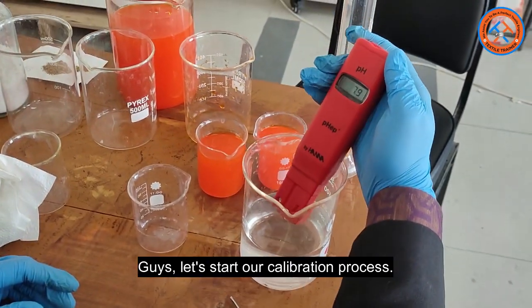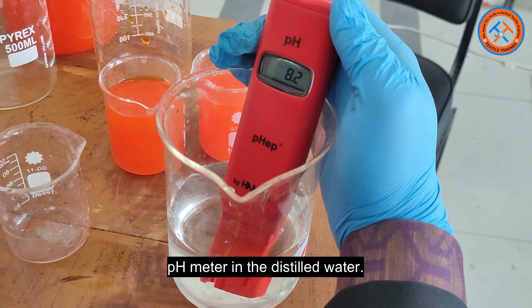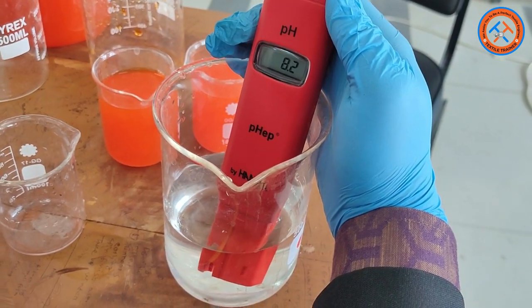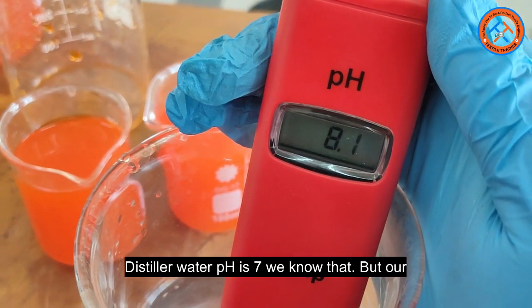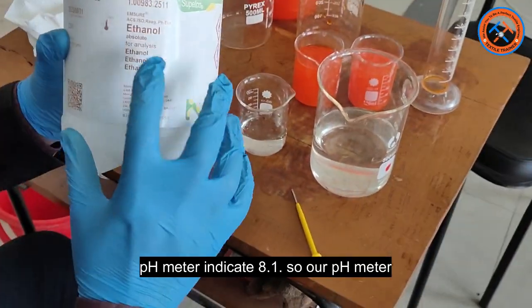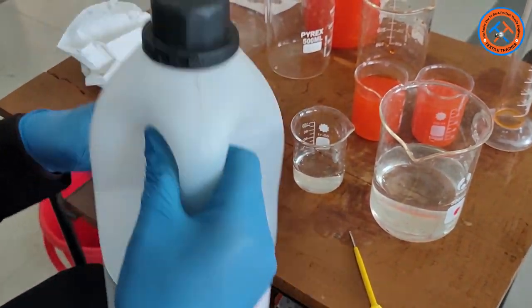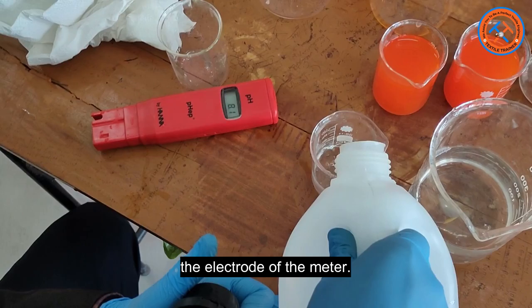Let's start our calibration process. First of all, we place the electrode of the pH meter in distilled water. Distilled water pH is 7, we know that, but our pH meter indicates 8.1. So our pH meter needs calibration. Now, we took ethanol in a beaker to clean the electrode of the meter.